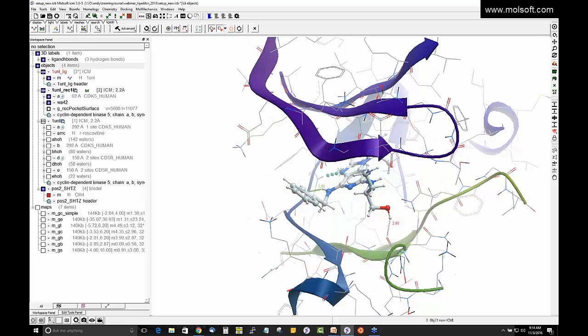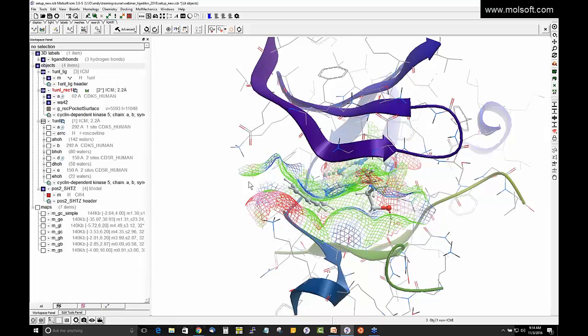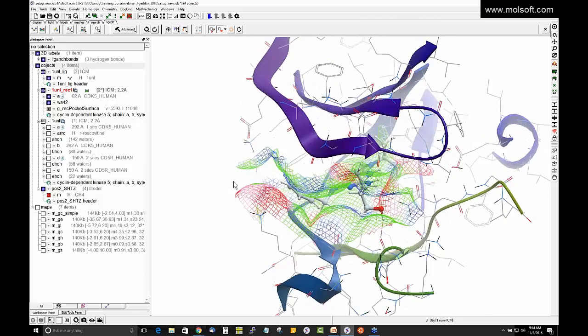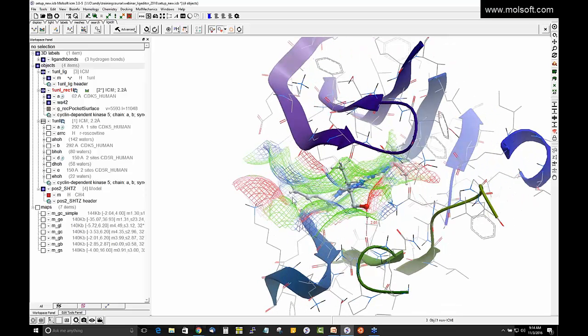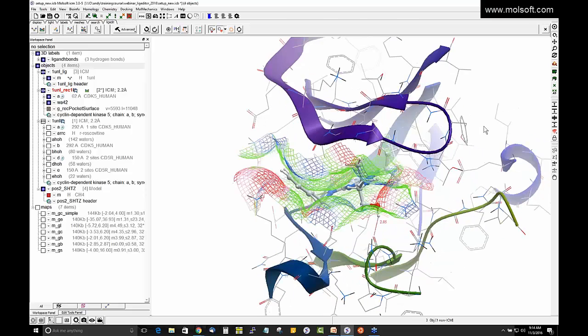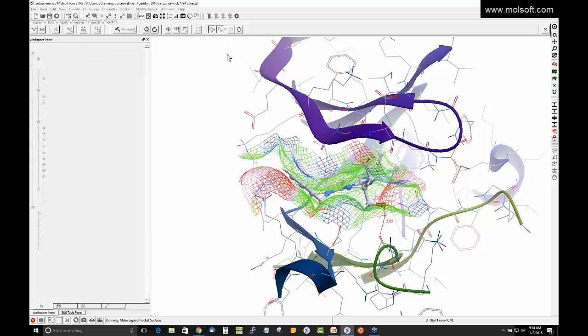The opposite of that is known as the ligand pocket surface. So click and hold here and select ligand pocket surface. You can see this generates a different view, the opposite actually of the other one. You can see that we have a cavity here that we can maybe build into. It sort of opens up, it's an easier way to see. And it also guides you, so you need to put a hydrogen bond acceptor here to make interaction with this hydrogen bond donor, for example, or matching hydrophobic with hydrophobic regions. So it's a guide. And if you click and hold here, we can undisplay that.